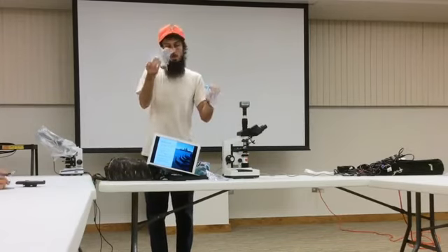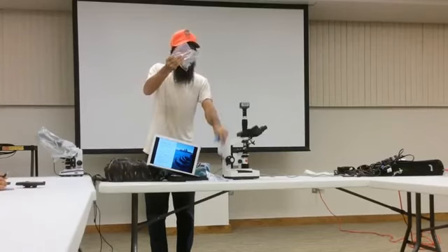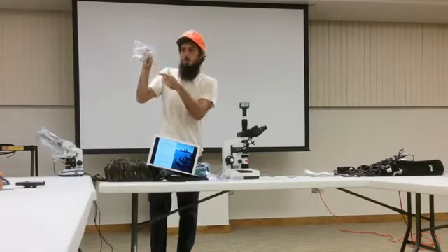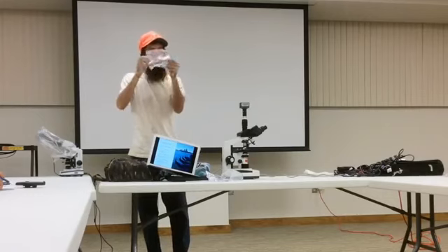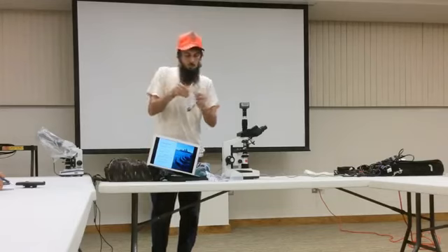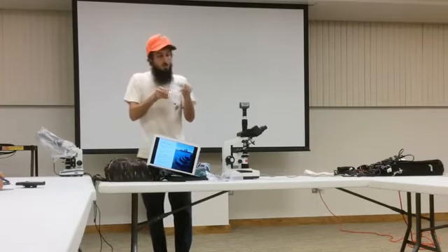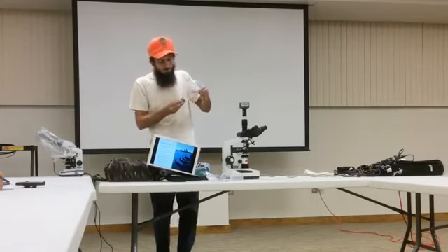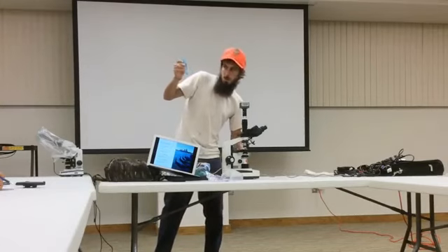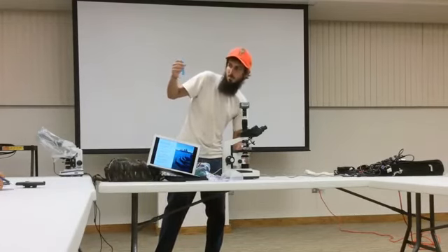So I try to pick healthy soil samples, and notice how this one made the bag already kind of wet. So I know that whatever's in here is alive because it's breathing. I'm just gonna open this bag and use this as my soil sample to prepare the slide. I want to do it 1 to 5.